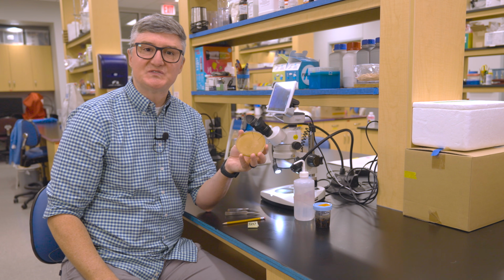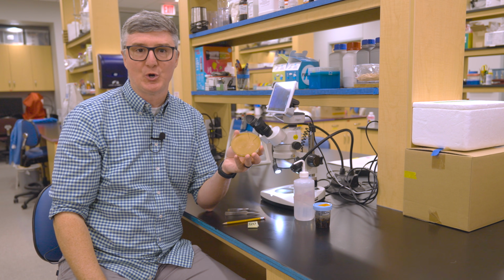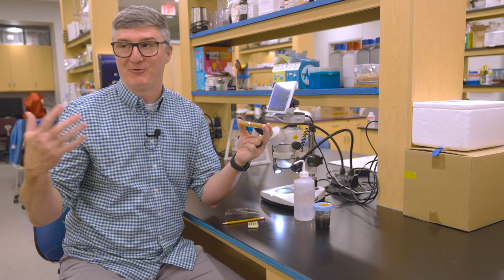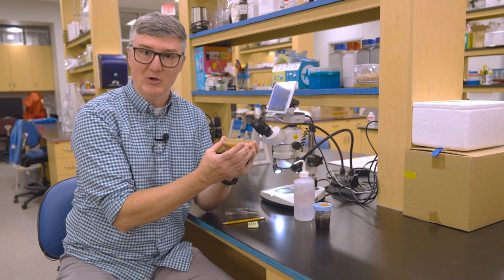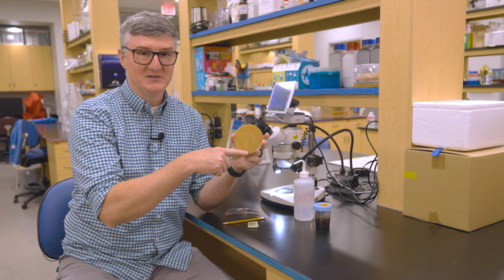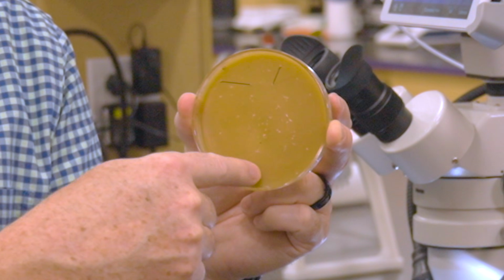You're going to need some sort of substrate into which you secure the bee. Now, this happens to just be a glass petri dish. I work in a laboratory. We have lots of petri dishes here. But any shallow container, like the lid of a jar, would work well. And when I tip it this way, you're going to see that it's conveniently loaded with beeswax.